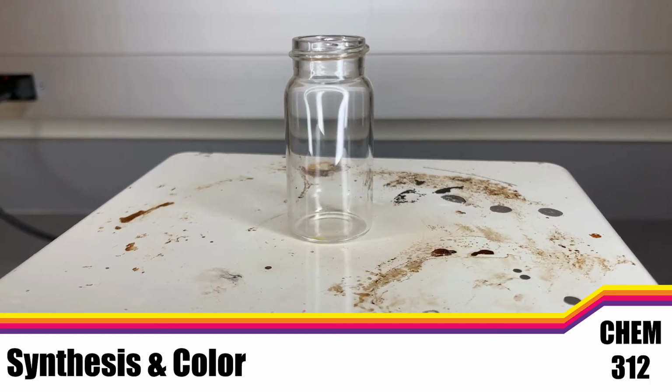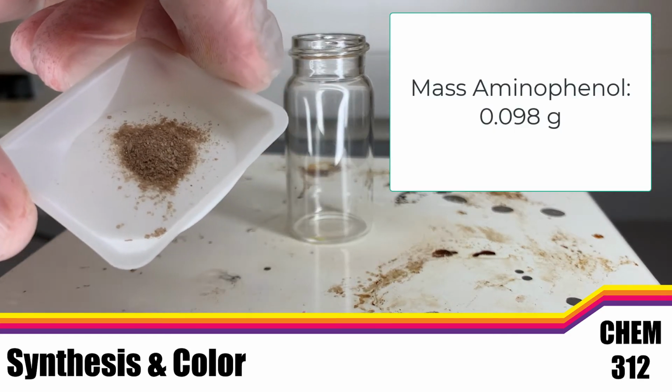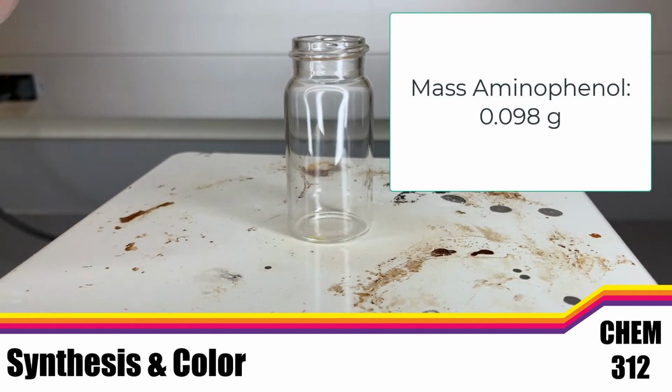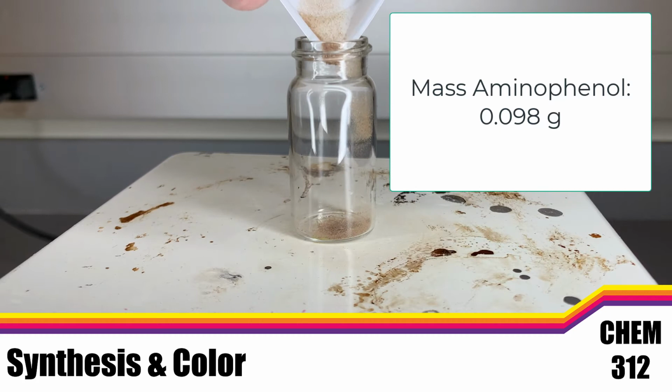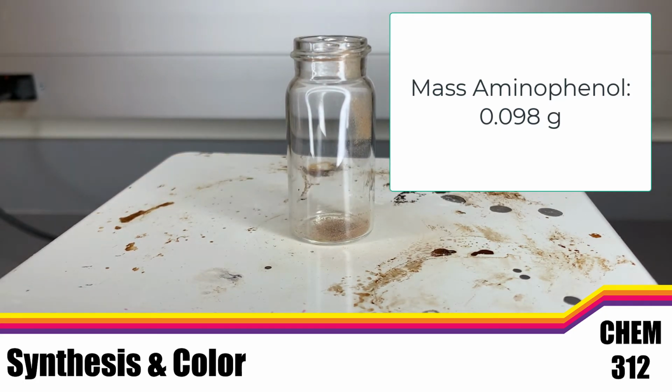Here we have our scintillation vial that we are going to use to run today's experiment. I've already weighed out our reagents. Our first reagent is going to be our aminophenol, and here it is. It's this brown solid, so I'm going to go ahead and add this into our scintillation vial. So we have our aminophenol in there.